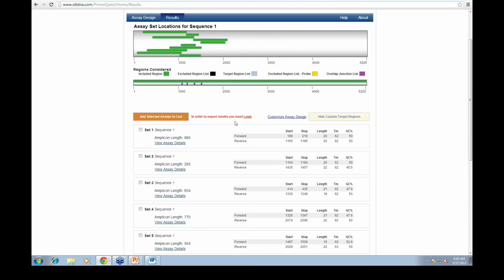I think you said that the first part of that question was, can they find the information about these assays, like for the hairpin formation or homodimers or heterodimers, and find out what the scores are? And then this person is also asking, when you get those scores, what's a good or bad score, but that's a different conversation, I think, because that's a different tool. That's kind of with Oligo Analyzer.